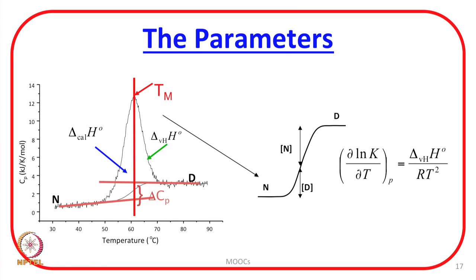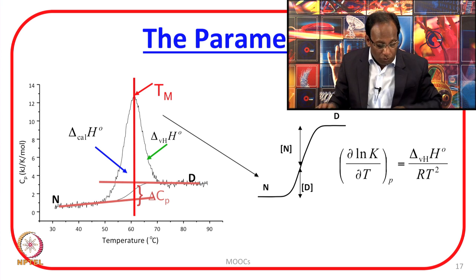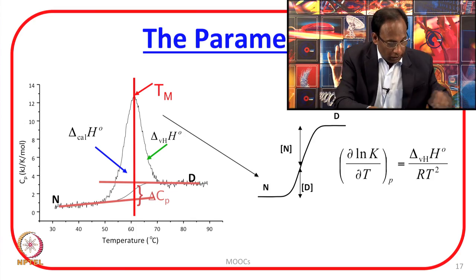And suppose I integrate this differential scanning calorimetric curve, the integrated plot will look like this, right. So, let me go back here.